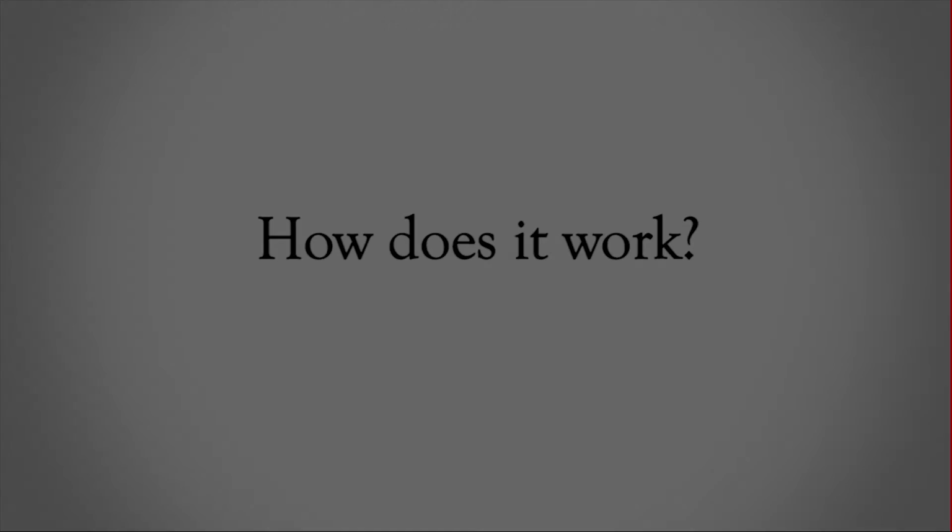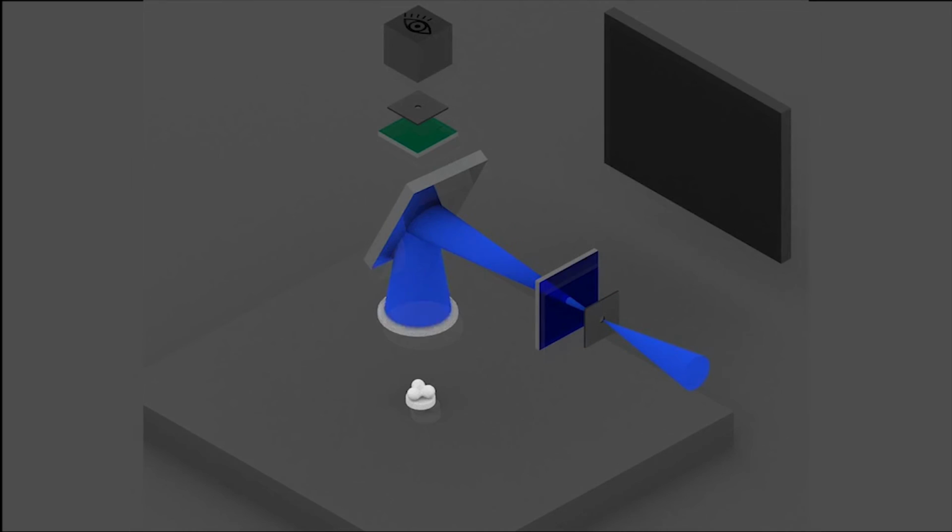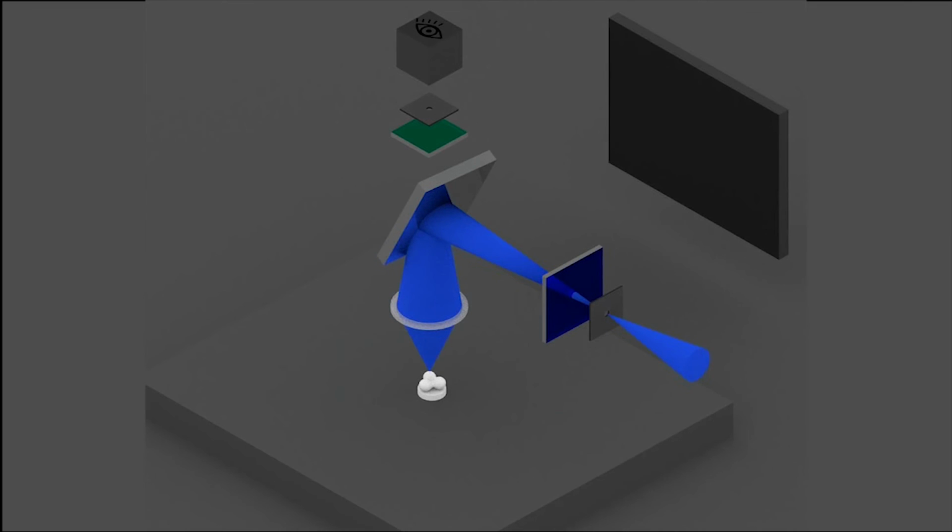The confocal microscope is a special type of fluorescent microscope. A significant difference between the confocal and fluorescent microscopes is the presence of a pinhole aperture at the confocal position. Lasers, which are usually linearly polarized, are used because they are intense, coherent, monochromatic sources of light and are thus capable of being expanded to fill an aperture or focus to a spot. The laser is first focused by the excitation pinhole on only a small part of the sample, but before the laser reaches the sample, it must first pass through the excitation and barrier filter that can be either a short, long, or bandpass filter. Its purpose is to only allow the required excitation light to pass to the specimen.